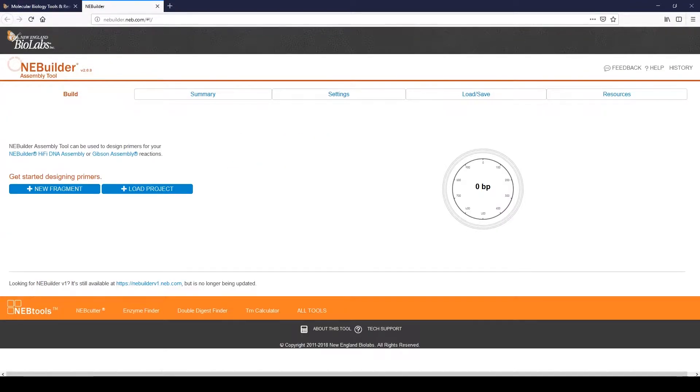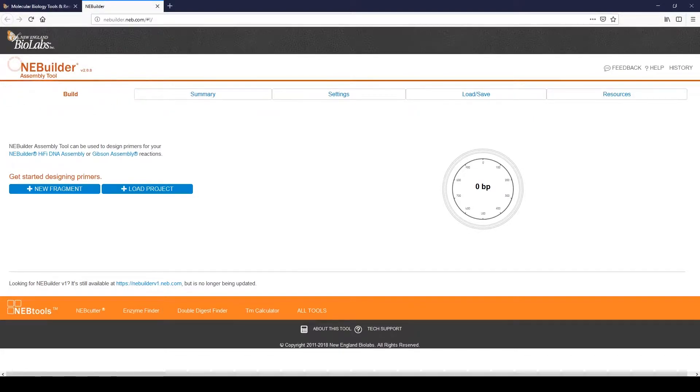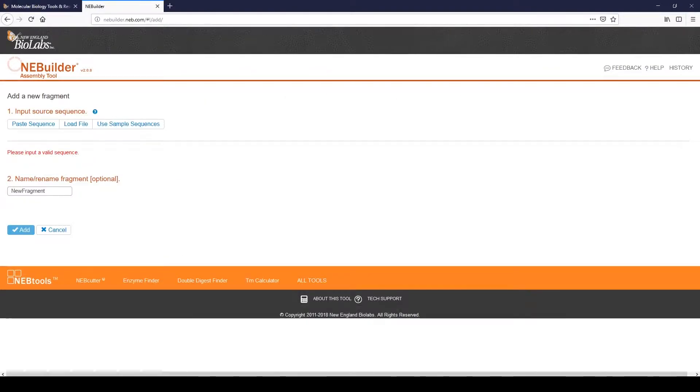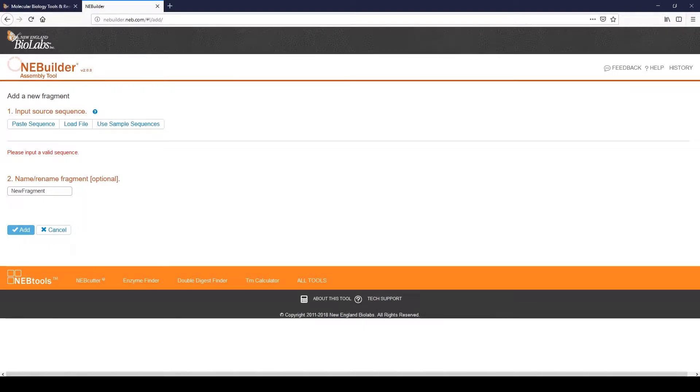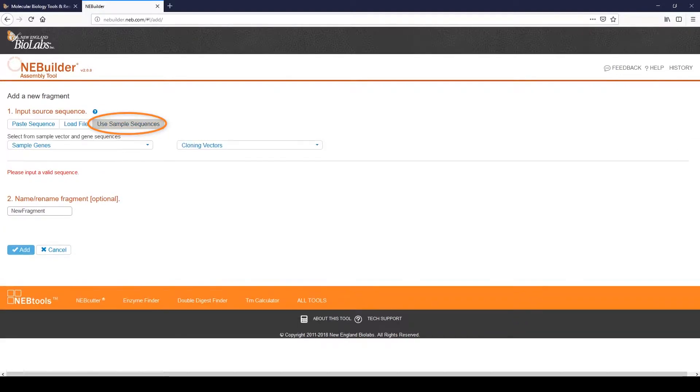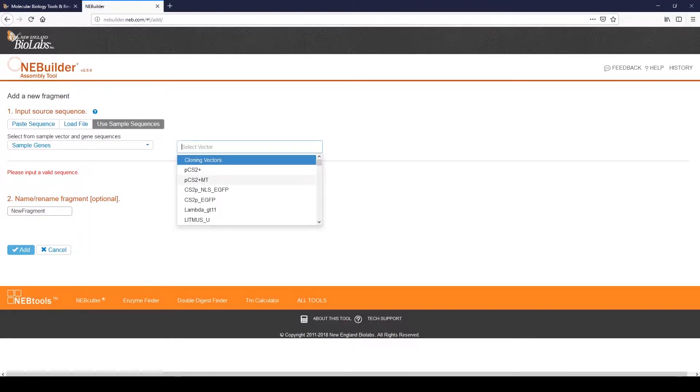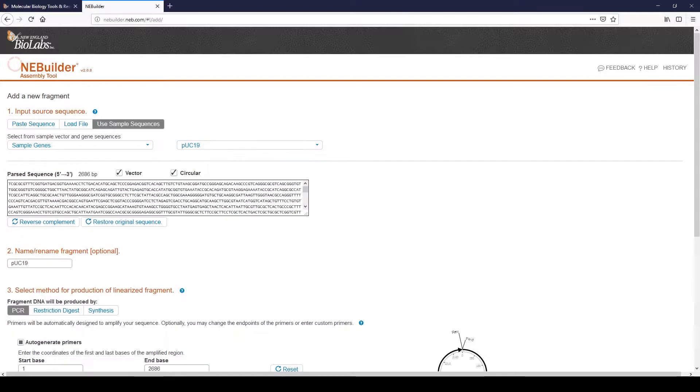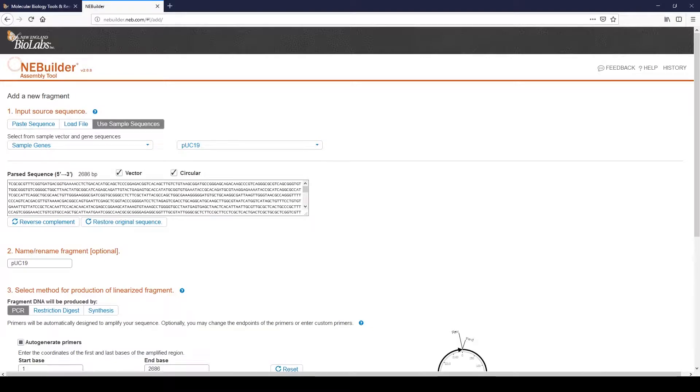Now we will add the fragments to the assembly. Begin by clicking on Build, then click New Fragment. For this demonstration, we will use preloaded sample sequences. Note that all vectors available from AnyBuilder are preloaded into the tool. Click Use Sample Sequences. Select a cloning vector from the drop-down menu, in this case, PUC19. The selected sequence is now loaded in the Sequence field.